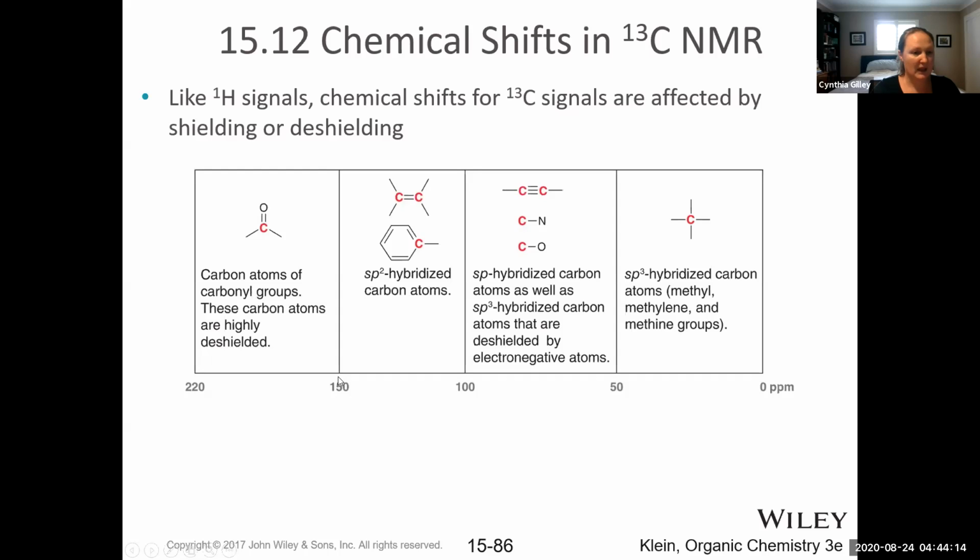And then carbonyl carbons, like for many different functional groups, right? These are very common in organic molecules. Those are going to come the most downfield because, again, the presence of a nearby electronegative group and the anisotropy of the pi bond will cause it to be the most downfield, anywhere from 150 to around 220. And that's really all the information we can get from carbon-13.